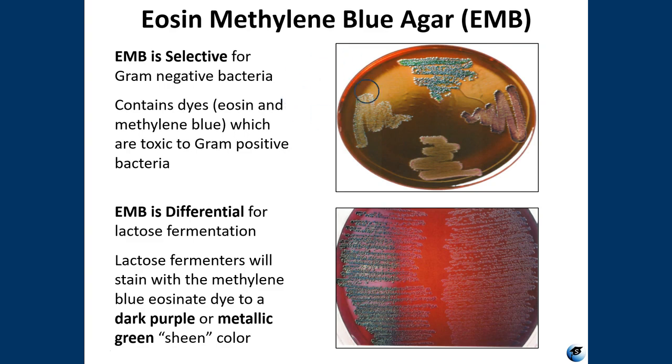And this would be a case where you'd have to compare this species' growth on this media to how it is growing on a general growth media to determine if maybe it's a gram-positive or gram-negative. So that's a bit tricky, and I will talk about that some more in lab. Note that it is, again, possible for a gram-positive to grow on media that selects for gram-negative, and it is possible, as we saw on the PEA, for a gram-negative to grow on something that selects for gram-positive.